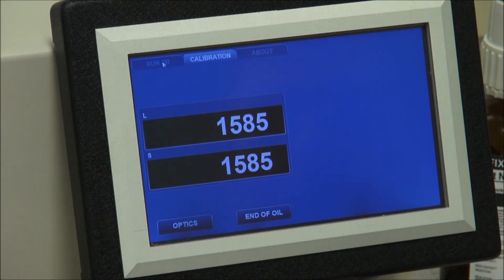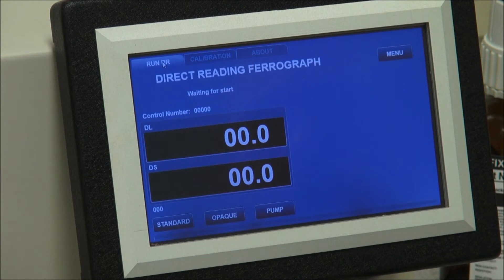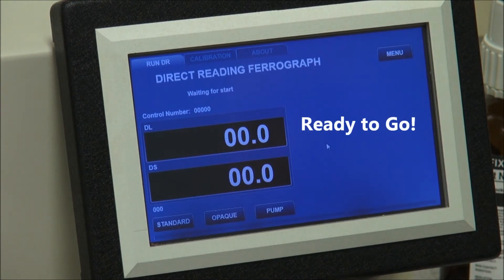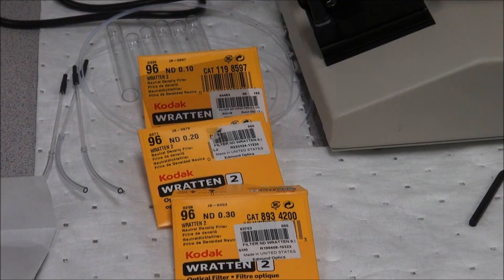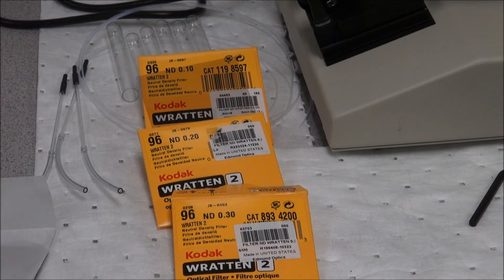Go back to the main screen by hitting the Run DR tab in the upper left. You are now ready to run a test. In order to assure that calibration is valid, we want to use density filters. There are three different density filters: a 0.1, a 0.2, and a 0.3.